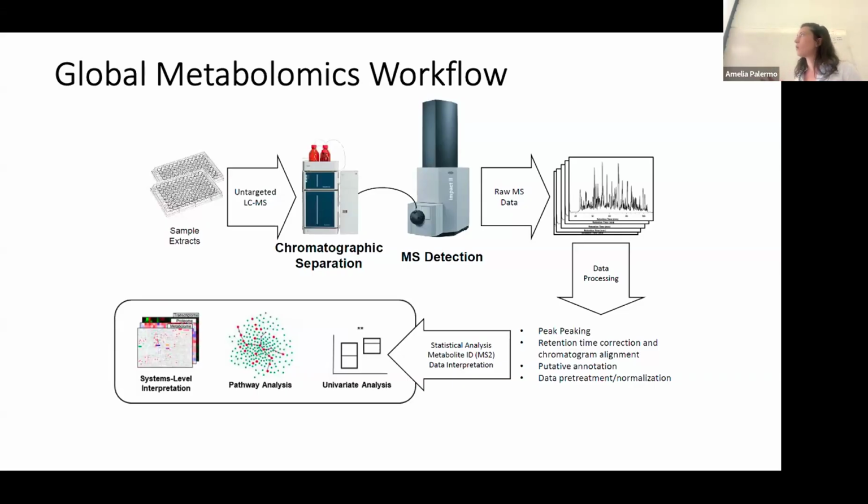So that's the reason why, depending on your very broad initial hypothesis of which sections of metabolism are interesting to your project, that can help you tune the initial sample prep to minimize that, in a way that you can favor the detection of that subsection of metabolism that is interesting to you. So it's really a trade-off. There is no one-size-fits-all approach.